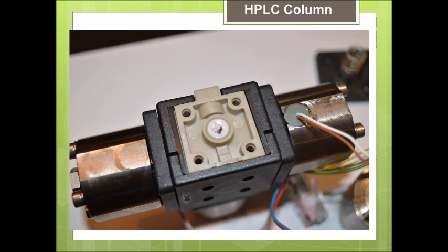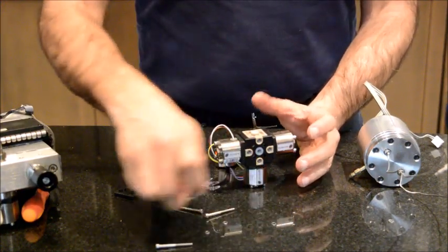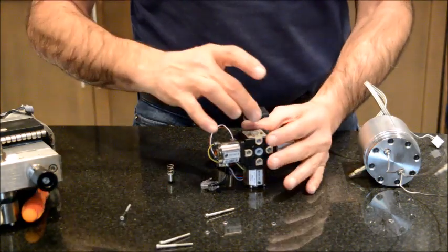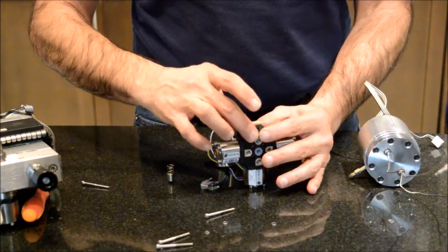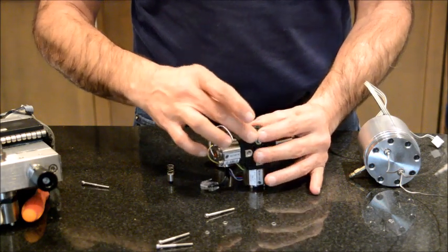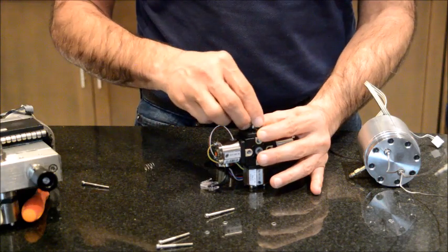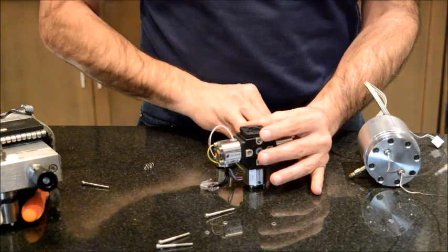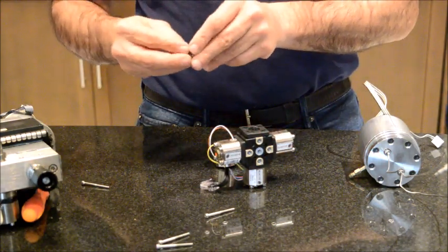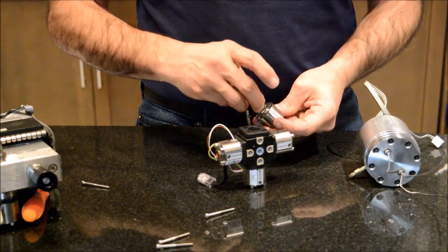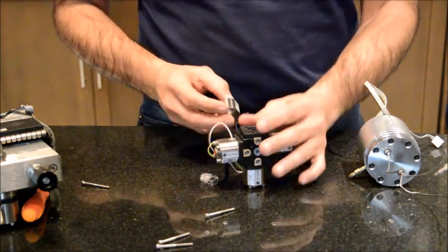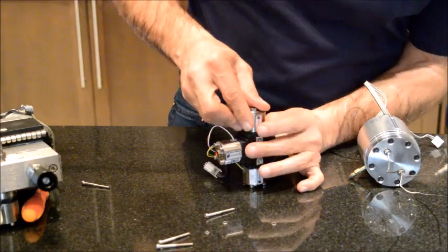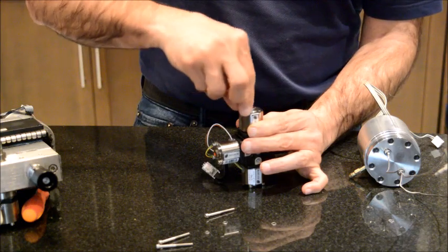I'm going to put them back to the original condition and I will put this dark one on the top. I will put my plunger. It is not that easy. I will put the plunger inside the solenoid valve. I will attempt to do it that way, which I succeed, and screw back the unit.